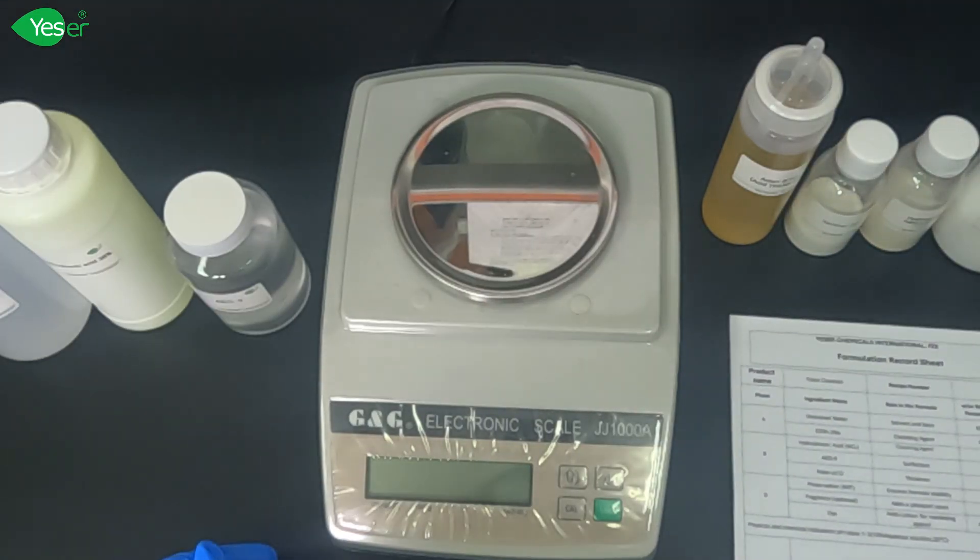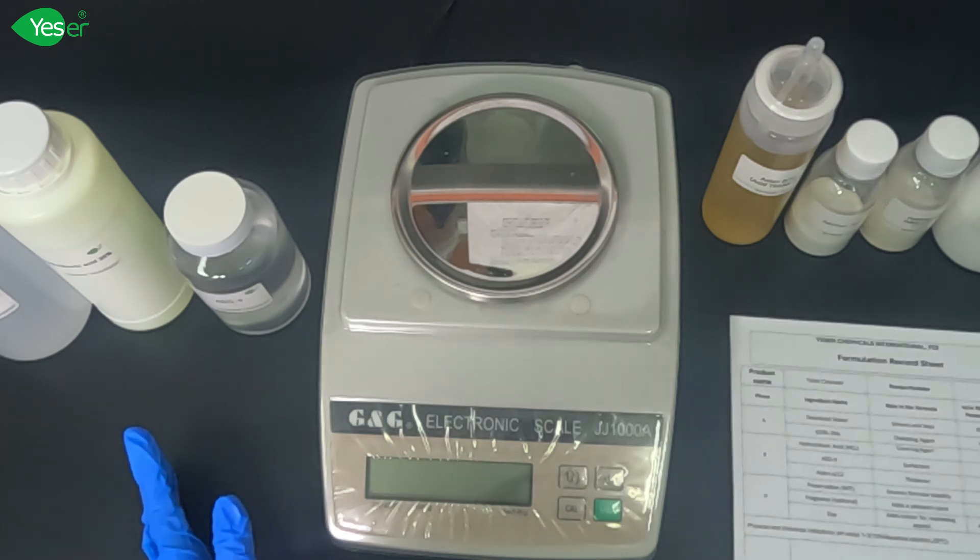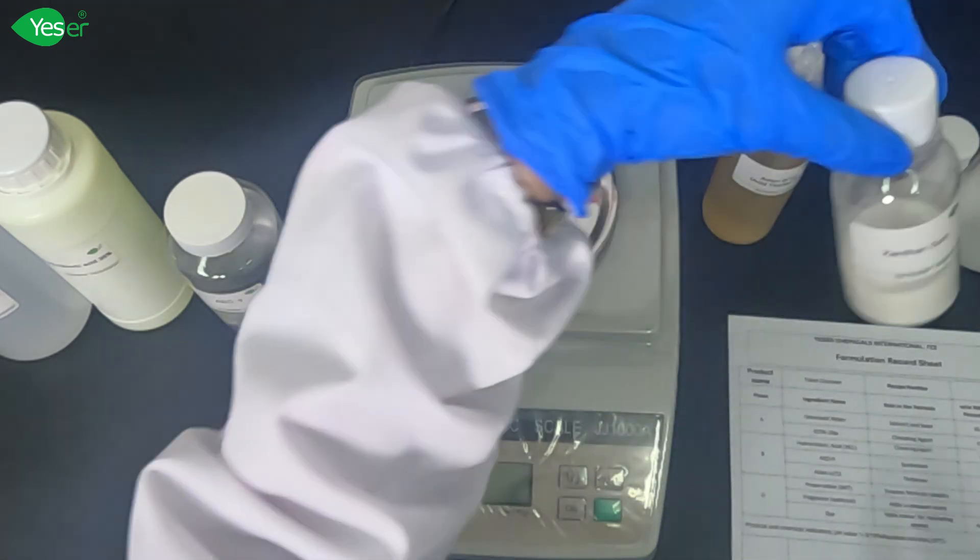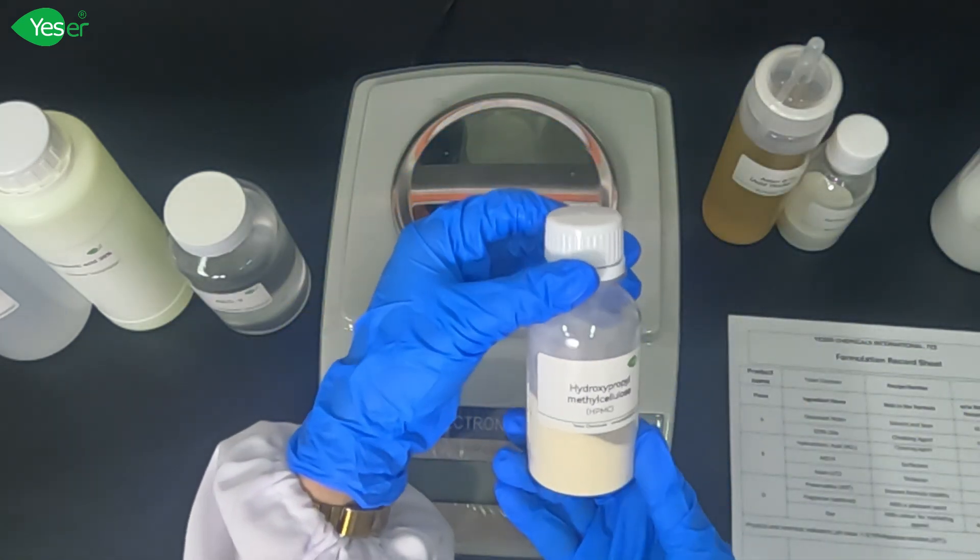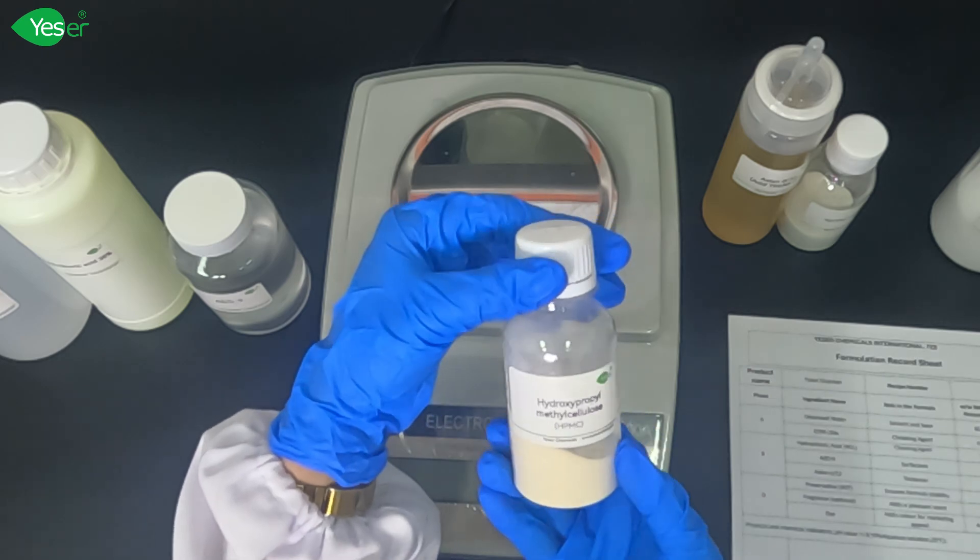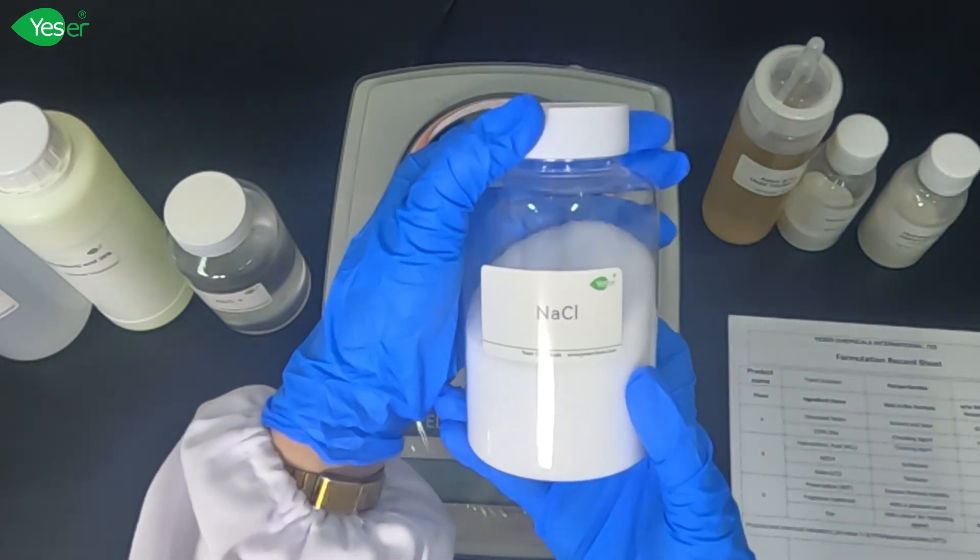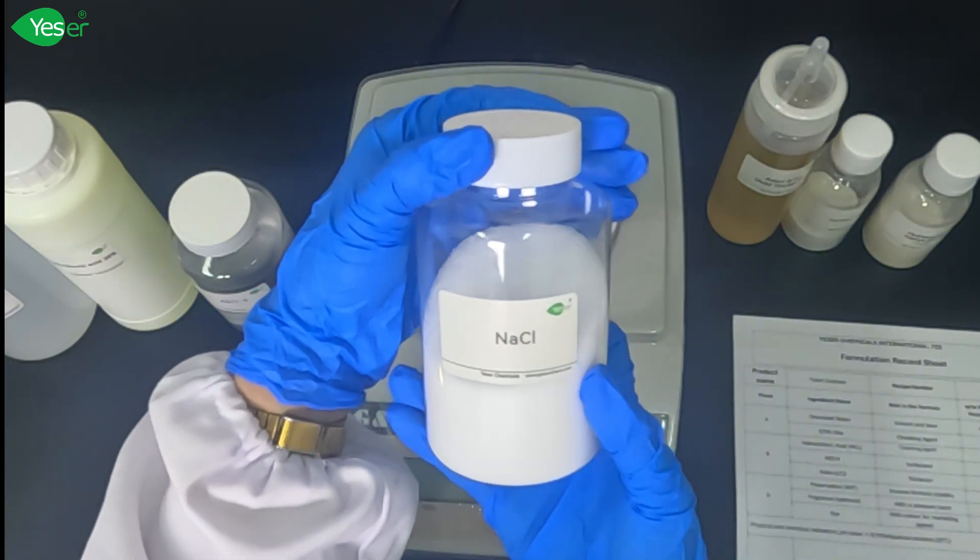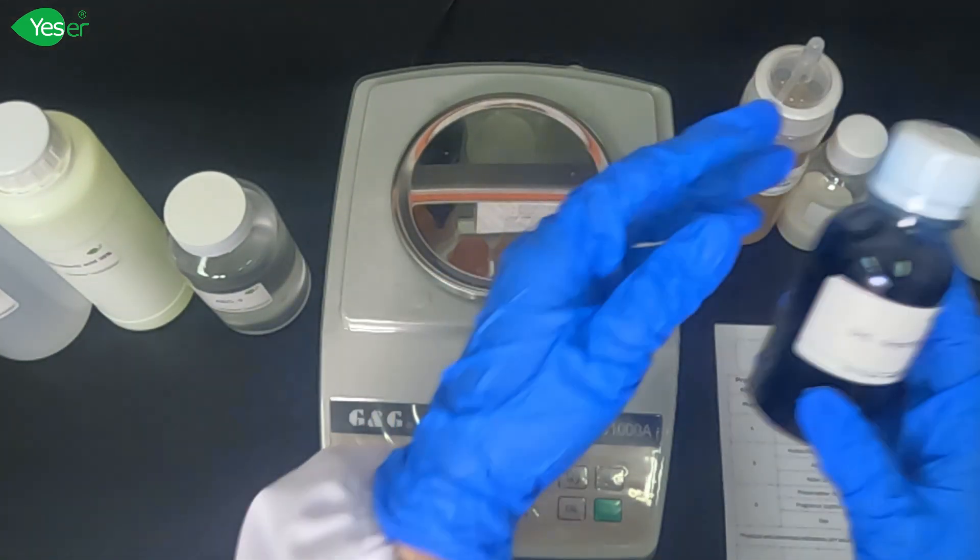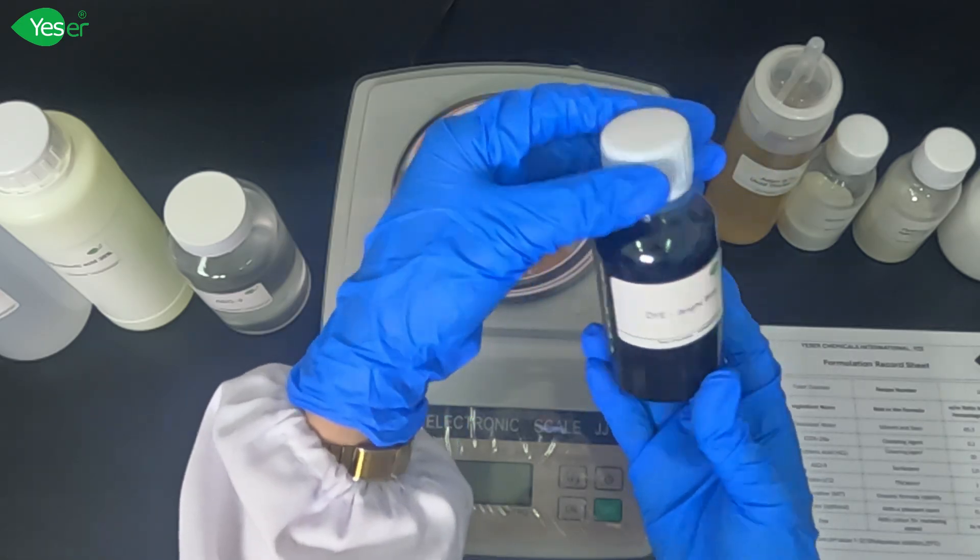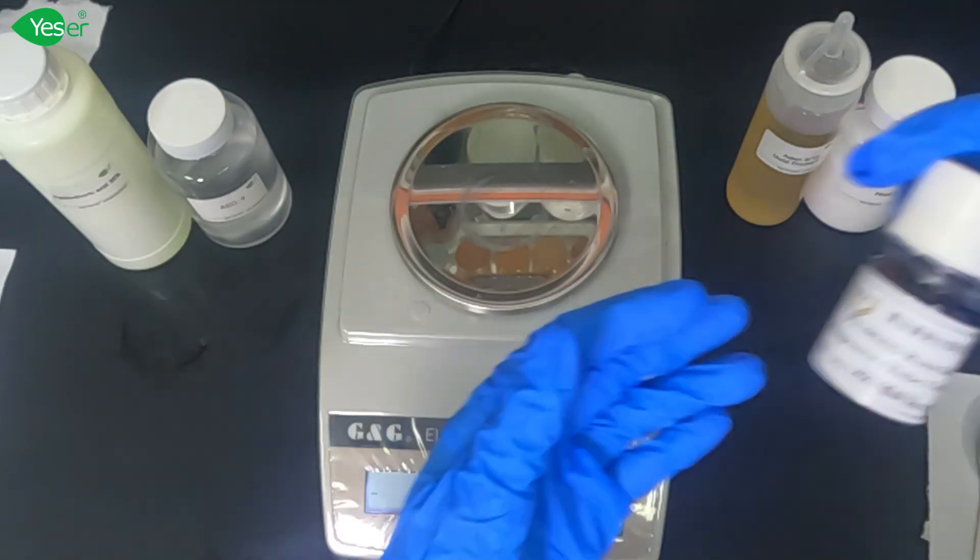For the other thickeners, we will be using common thickeners that are used for home care and personal products: xanthan gum, hydroxypropyl methyl cellulose or HPMC, and sodium chloride or salt. Next ingredient we have is dye to add color to our product, and fragrance.